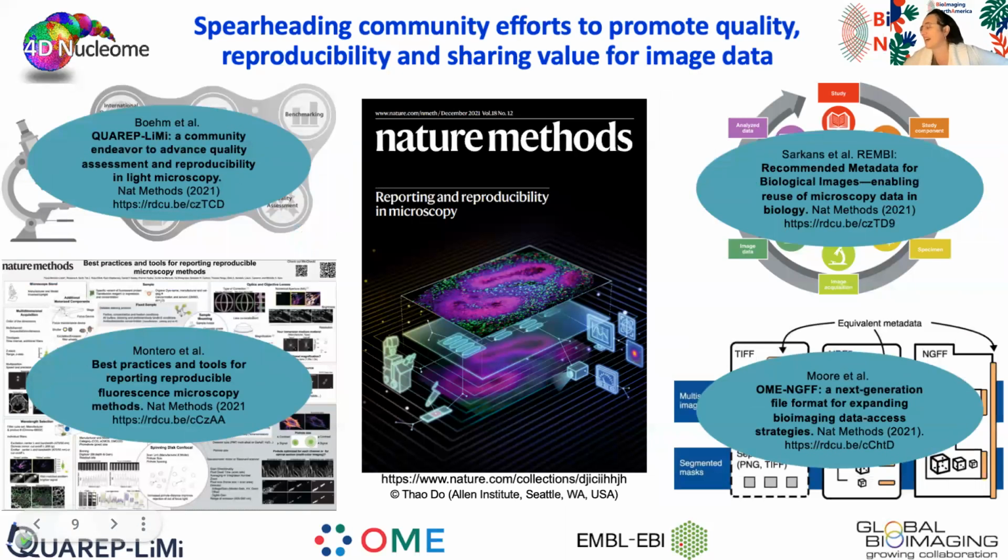So in the 9 different papers, there is going to be a paper by Global Bioimaging presented by Shuichi Onami about all of these different global initiatives to achieve common standards. And then there is going to be a presentation on QUAREP-LiMi as a whole, on best practices and tools, on what is the problem and why we need to solve it.